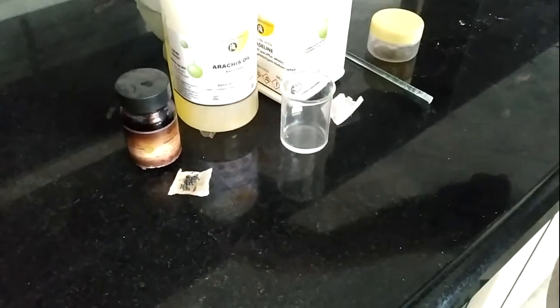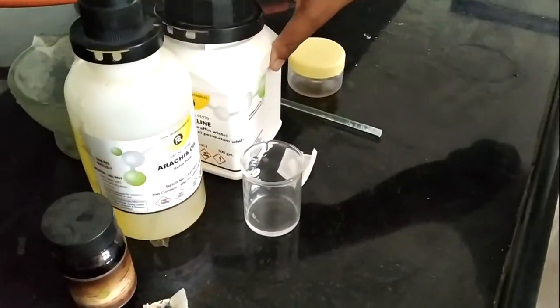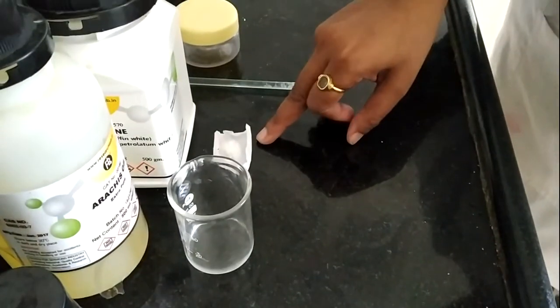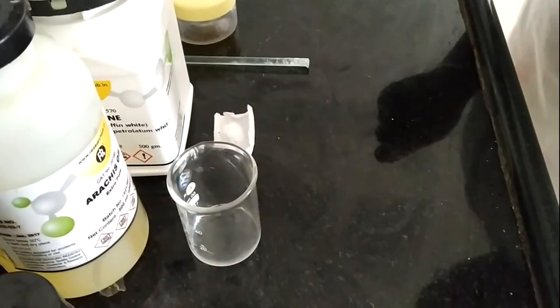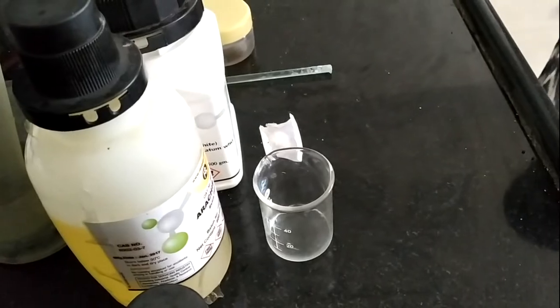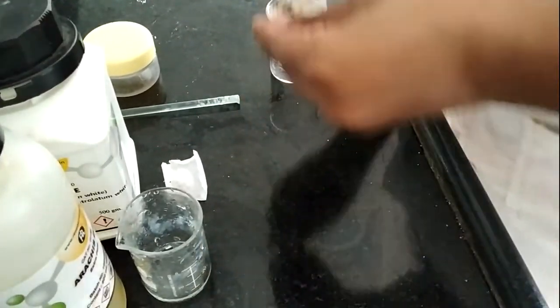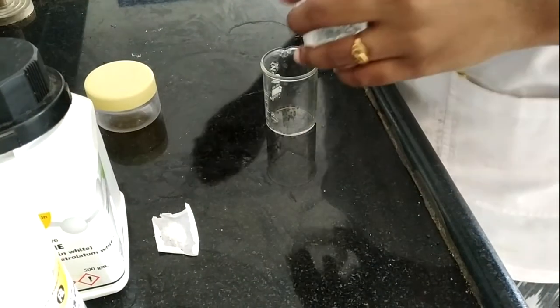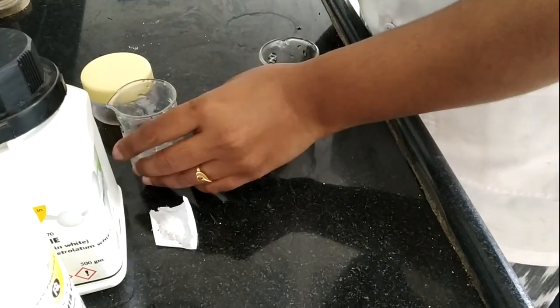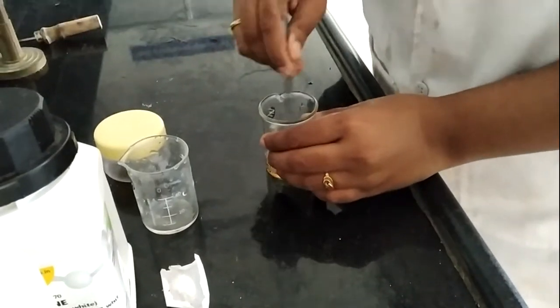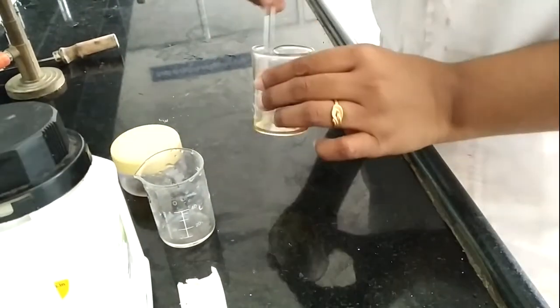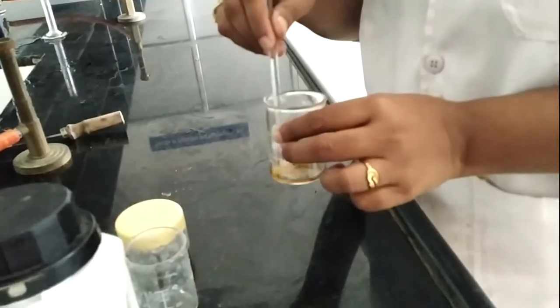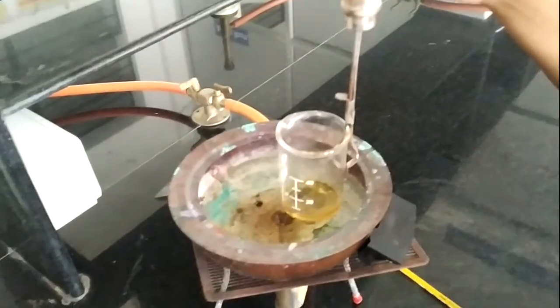We have iodine, arachis oil, and yellow soft paraffin. The arachis oil is taken into this, and this is yellow soft paraffin. Now I am going to mix all these things. I take the iodine crystals into this beaker glass, after that I add the arachis oil into it, and now I proceed for stirring it properly. After proper mixing, we have to heat it till its brown color disappears.